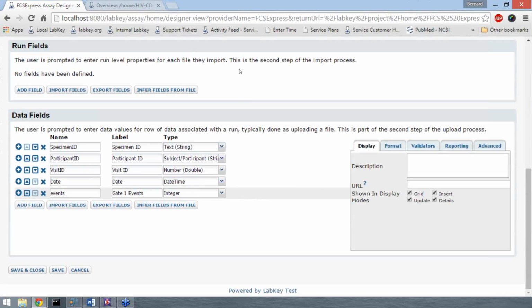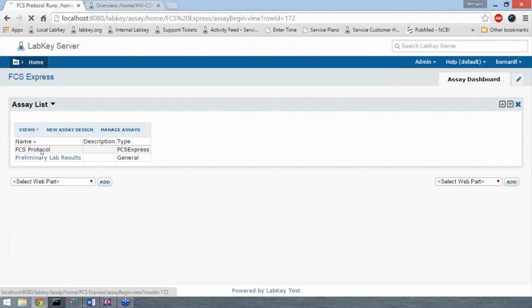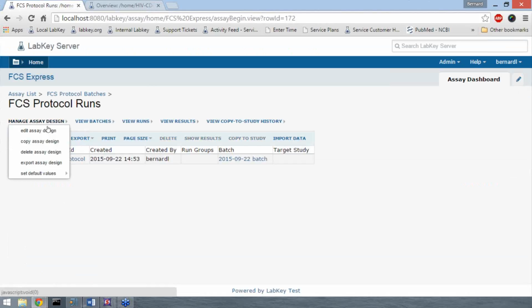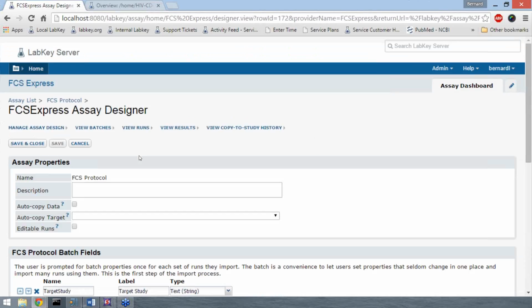And you simply populate each of these fields in the way that the export will show up, and the files, including protocols or images, will show up as thumbnails. Once these are populated, normally you'd simply save and close, and your new assay design would appear. But in order to save a little bit of time, I'd like to just show you one that I previously made to match the export that Kaya produced.